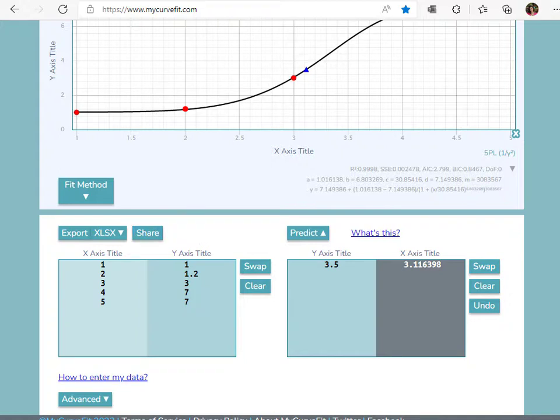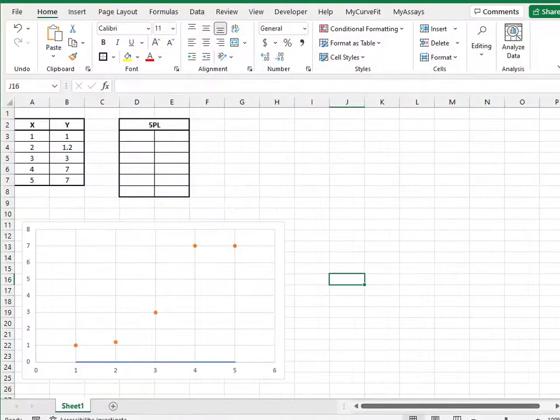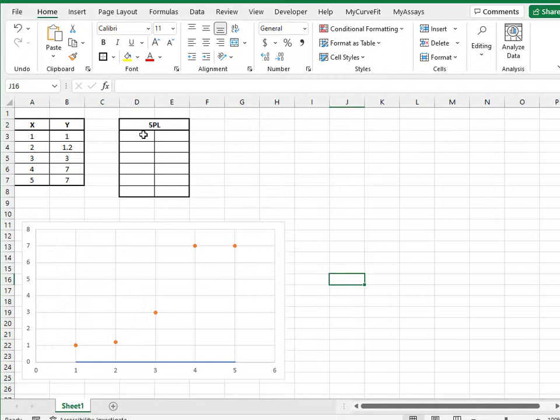To use the MyCurveFit XL add-in, open Excel and enter your data point X and Y values. Highlight the appropriate number of cells. At minimum, the number of parameters in your fit method.